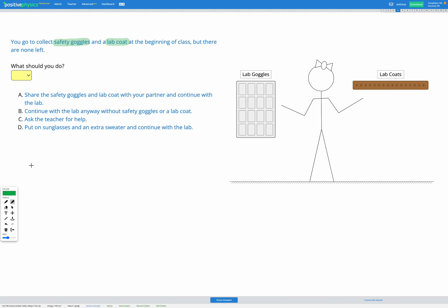So what should you do? We've got four options, so let's read through each option. Option one is to share the safety goggles and lab coat with your partner and continue with the lab. This might sound like a good option, but our rule that we need to follow here is that safety goggles and a lab coat are required at all times during a lab activity. So that's not going to be good enough. So A isn't going to work.